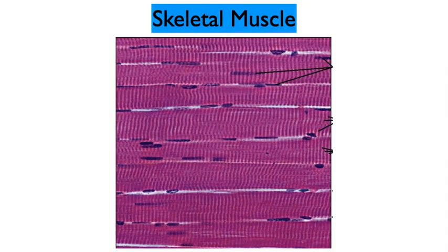Moving on to a third type of tissue, of course, is muscle. There are three types of muscle: skeletal, smooth, and cardiac muscle. Here we're seeing skeletal muscle, skeletal indicating these are going to be found connecting different parts of the skeleton, the bones, allowing for movement of body parts and movement of the entire person, whole body. Here you see very characteristic striations.